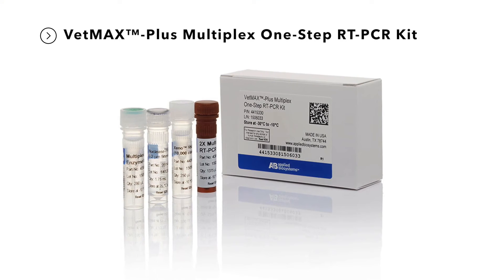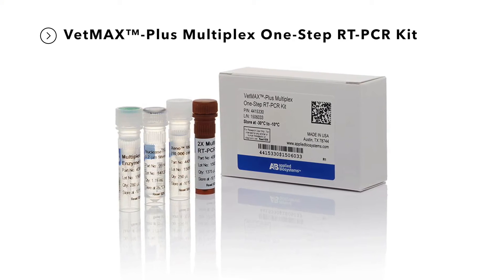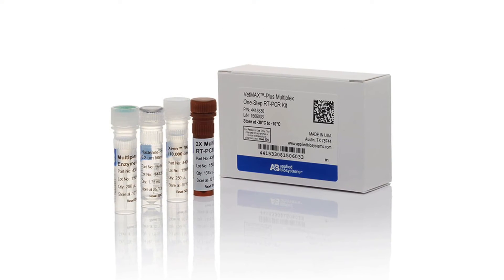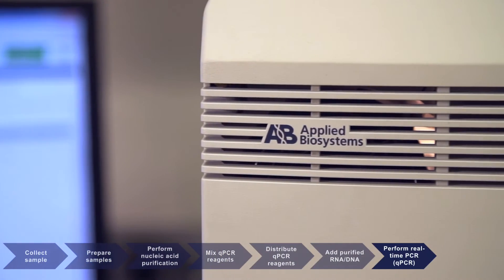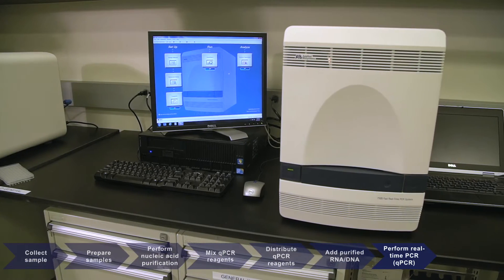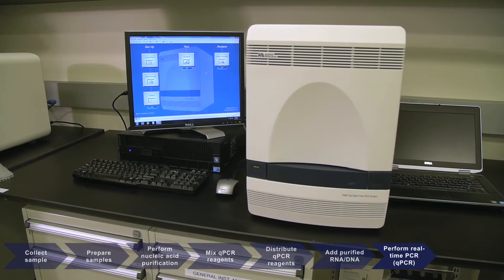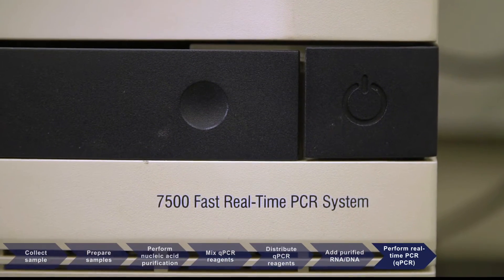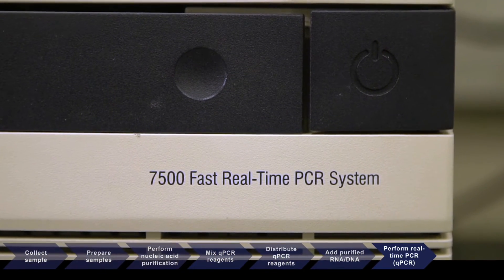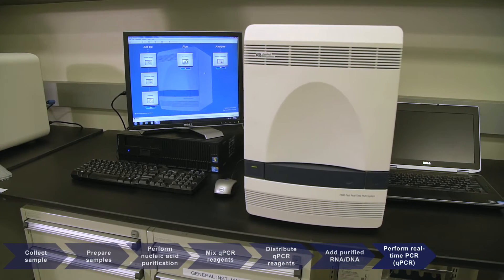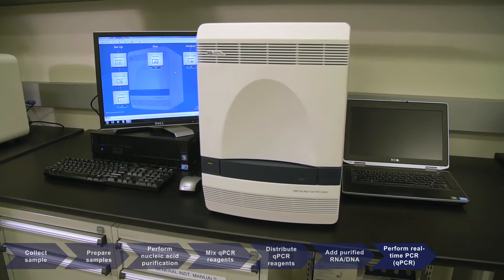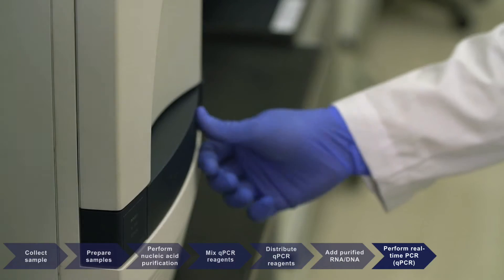Applied Biosystems reagents, assays, and kits have been validated on several PCR platforms, including the Applied Biosystems 7500 FAST real-time PCR system. The 7500 FAST is a versatile real-time PCR system for detection and quantification of nucleic acids in a standard 96-well format.